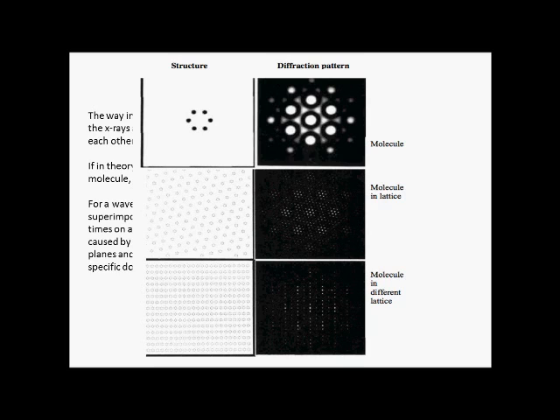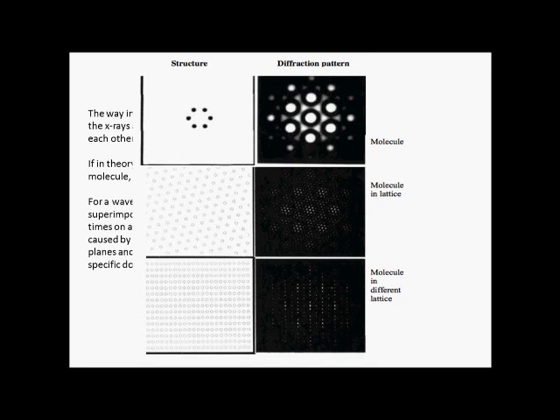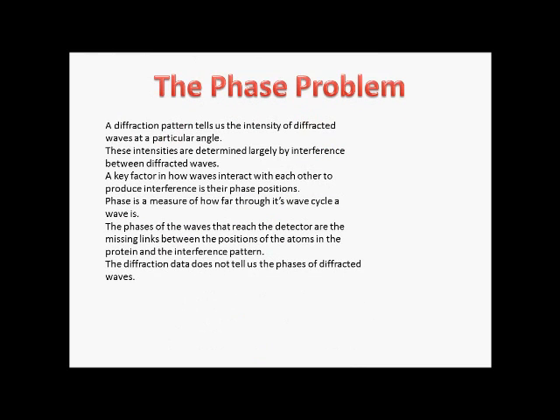Something you have to take into account when you're working back from diffraction data to a lattice structure is that not all the proteins are in the same orientation because they're undergoing symmetry. Some of them are upside down or the wrong way around. Nowadays we know the kind of diffraction data produced by each possible space group for a protein crystal, so it's very easy just to compare things to previous experiments using software and to have your space group worked out pretty much automatically.